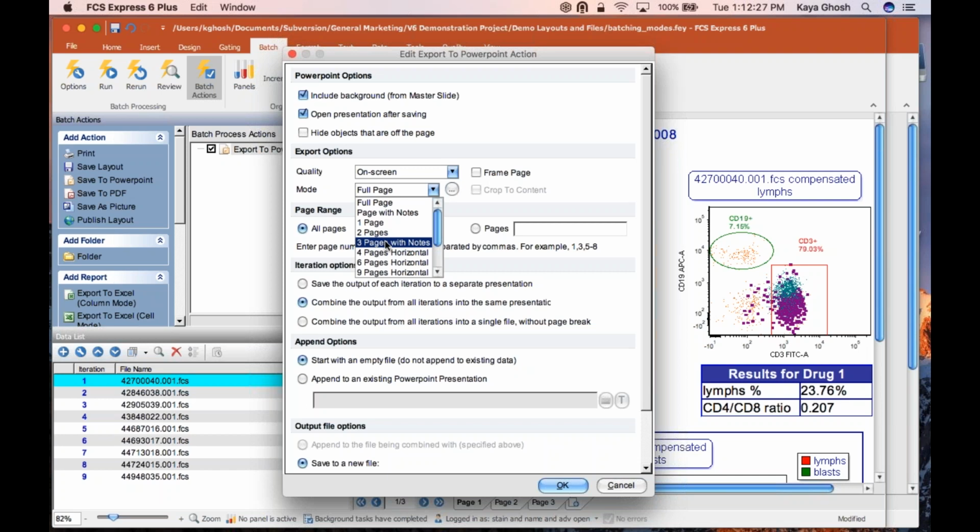Everything will fit nicely on a defined number of pages without anything spilling over onto other pages. If I choose here 3 pages with notes, you can choose whatever you want, but let's just illustrate that. So 3 pages with notes, if you think to PowerPoint options, they have these options for printing out the PowerPoint slides as handouts. And this is similar to that, where you would have the 3 slides on the left, probably, and then on the right-hand side, you'll have some space to make notes, okay?